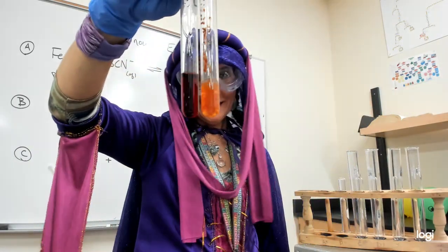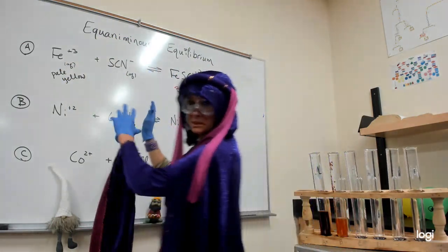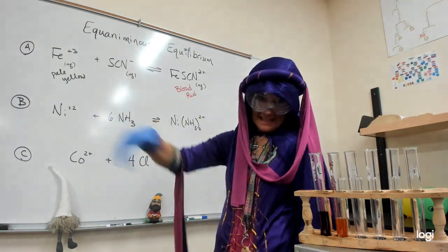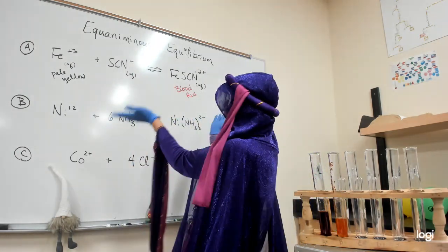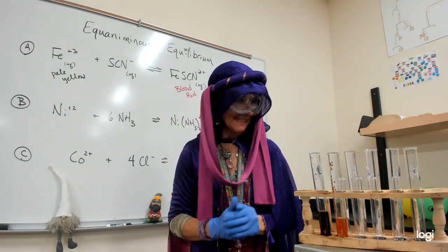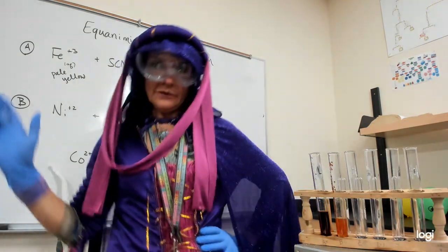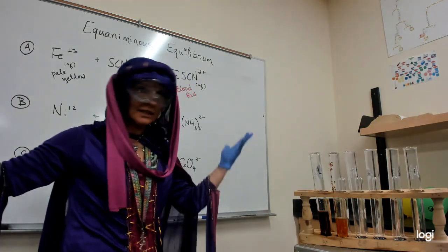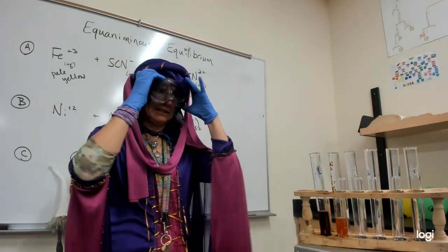Whereas the other one that I added hydroxide to, the hydroxide again, isn't part of this equilibrium, just pulls the iron out. And the whole thing has to shift that way. Adding something that's not interested in anything, like sodium nitrate, it just stays where it is, and we see the blood red. All right, you ready to move on to the next one? You can pause me and answer your questions about why. So you add a reactant, it shifts towards the product. You decrease the reactant, it shifts towards the reactant. You add something that nobody's interested in, nothing happens. It maintains its balance.